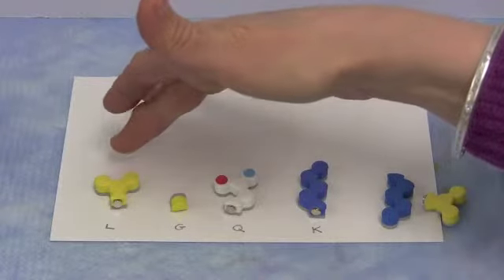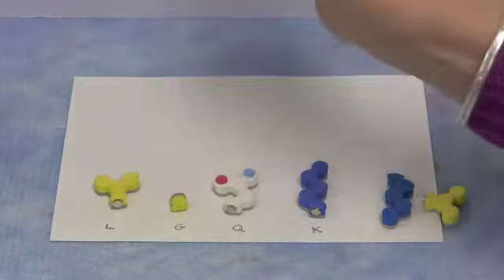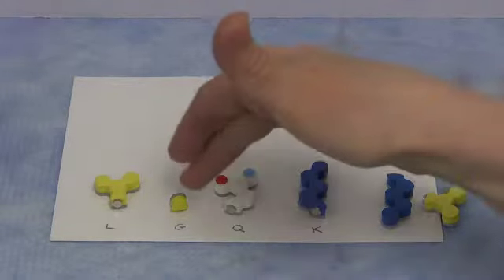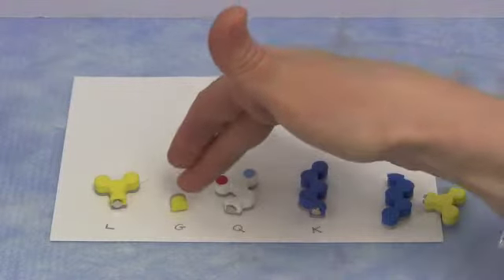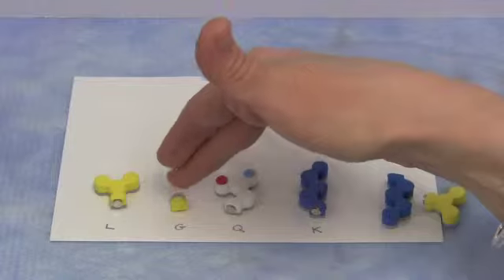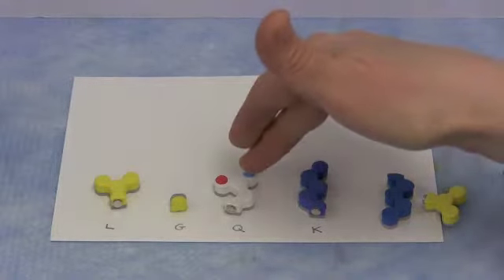So we have leucine, which is a non-polar aliphatic amino acid. We have glycine, which is still non-polar, but it doesn't have as big a non-polar side chain as the leucine does, so this is less non-polar than that one is. Then we have glutamine.